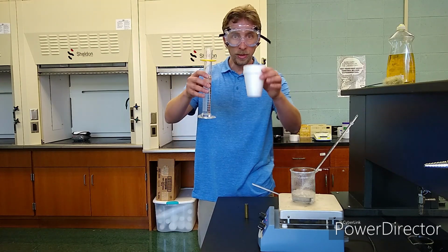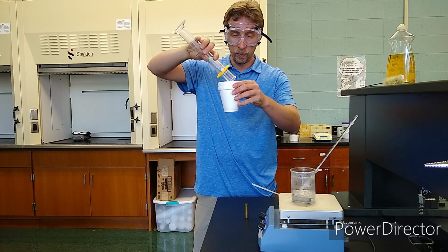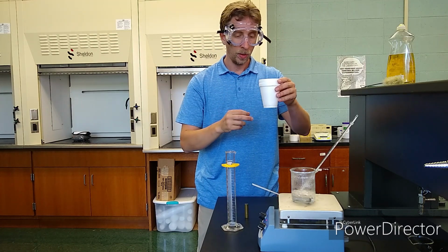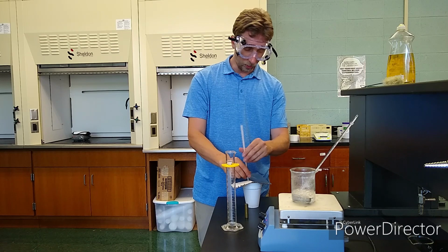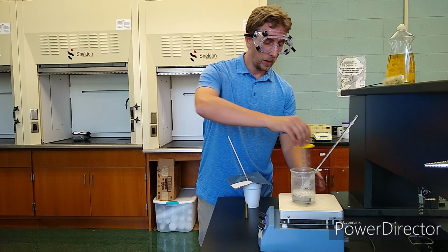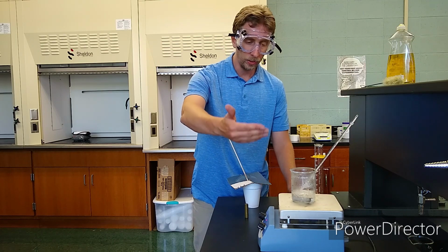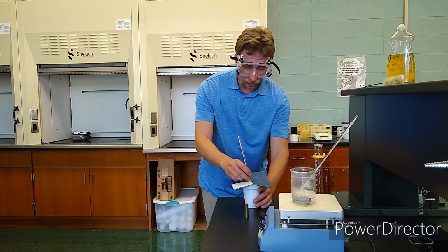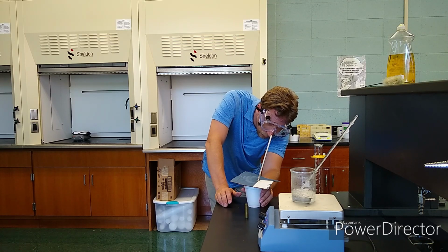So let's put the 79.6 grams of water into our calorimeter. All right. And we know that's initial temperature is what we also need to know for this water in the calorimeter, because we need to know the temperature change of the water in the calorimeter. We don't need to know the temperature change of the water, you know, boiling. We just know that it's hot water at 100 degrees Celsius, and the metal is at 100 degrees Celsius. So the initial temperature of the calorimeter is room temperature. Tap water should be about the same as room temperature.